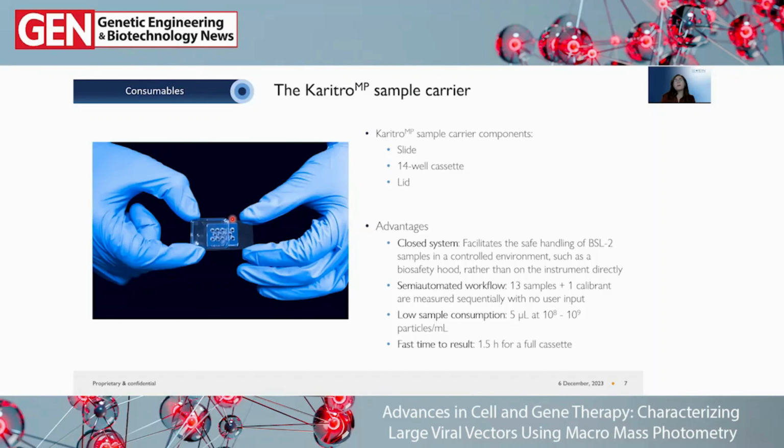The reason why we designed the system in this way is to allow for a closed system. Effectively, the operator would be preloading the cassette, so the sample carrier, in a safe environment, such as a biosafety hood. And then once this is loaded, they can close it with a lid and transport it outside of the hood and on top of the instrument.